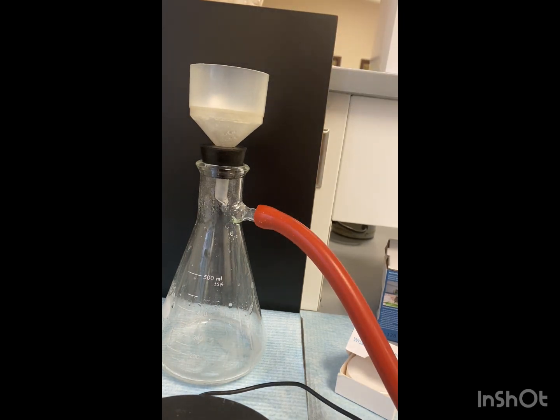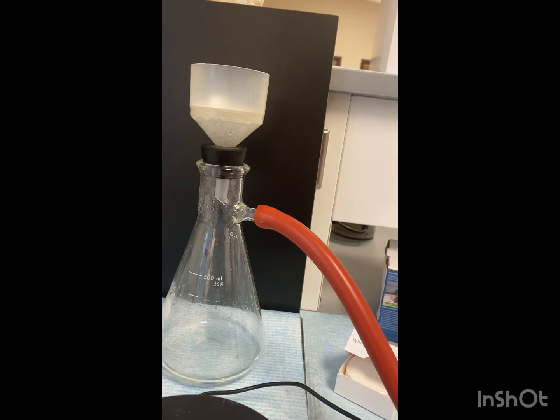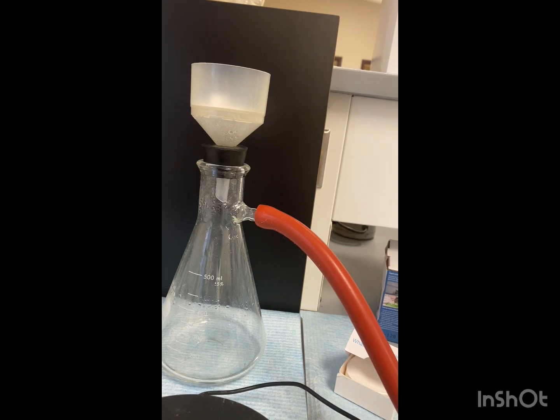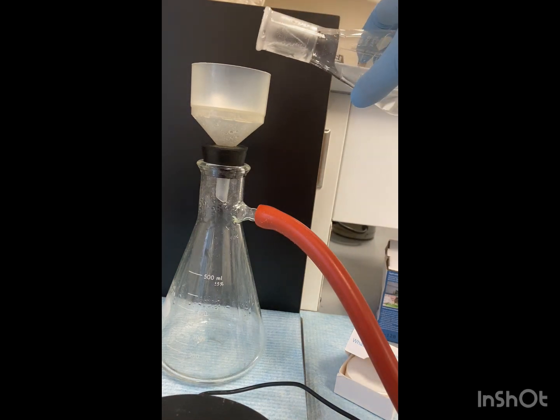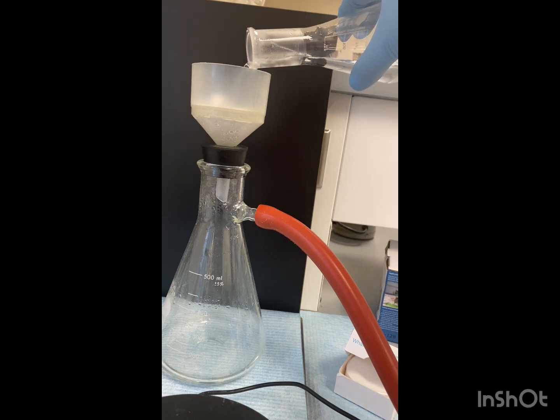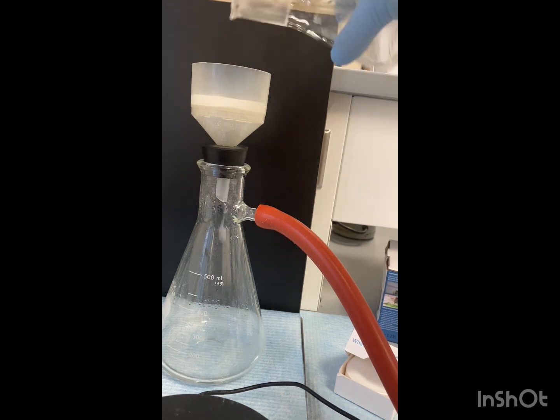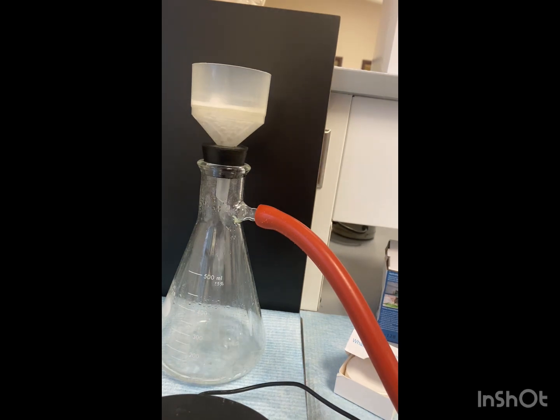We're going to use 20 mils of water to wash. Remember, we want to turn the vacuum off when we add our 20 mils just like we did with our acetone that we washed the first product with. So adding around 20 mils. Turn on the vacuum. And we're going to do that two more times.